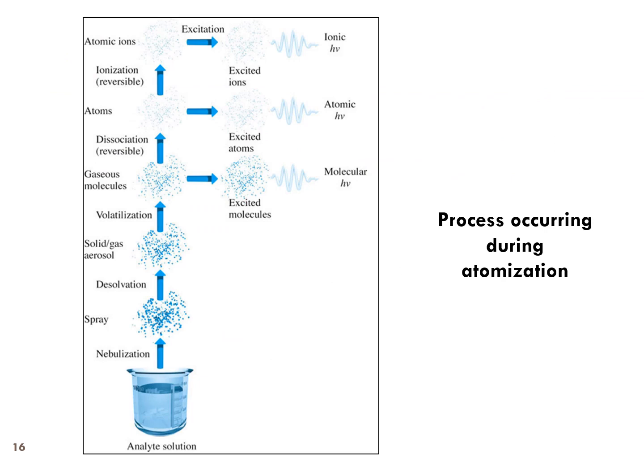Okay, ni dia bagi tahu sekali lagi, process occur during atomization. Lepas volatilization tu akan ada tiga form: molecule, atoms and atomic ion. And then tiga-tiga type ni bila kena radiation dia boleh jadi excited.